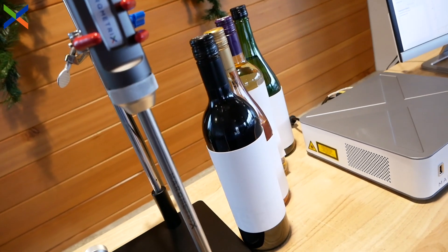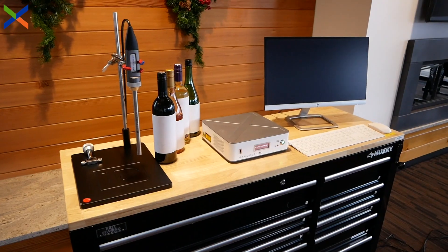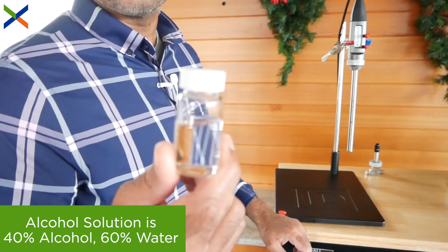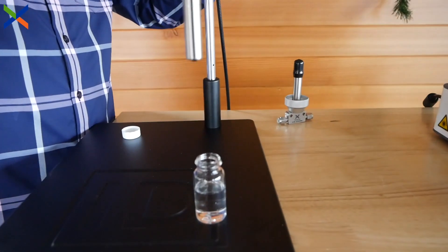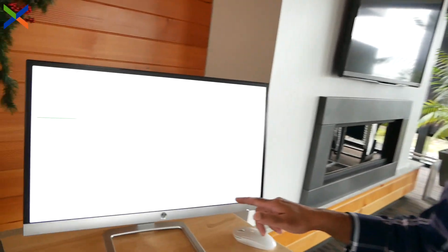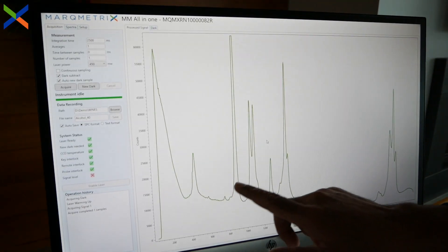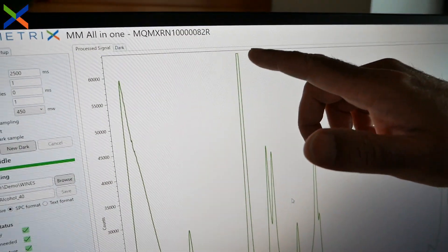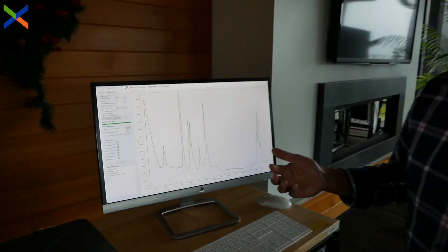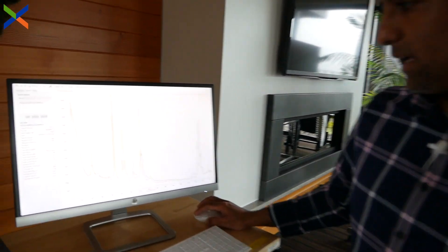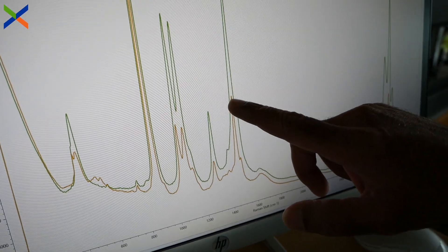By now you should have a good idea of the scope of compositional information the all-in-one can deliver in a matter of seconds — sugar content, alcohol percentage, fermentation progress, and the presence of carbonation are all easy to analyze with Raman. To compare alcohol content, I've prepared a 40% solution of alcohol and water. Here's the spectrum — these features belong to the alcohol, and after a certain time we begin to saturate our detector. This is way more intensity from the alcohol compared to what we saw in the wines.